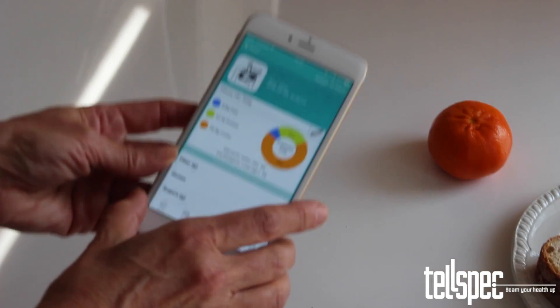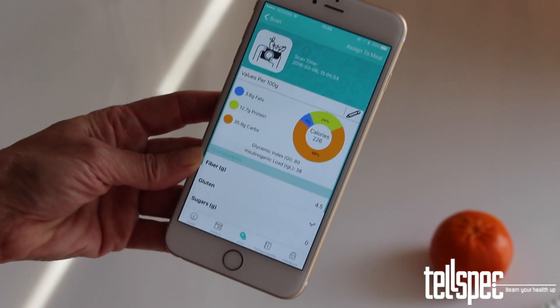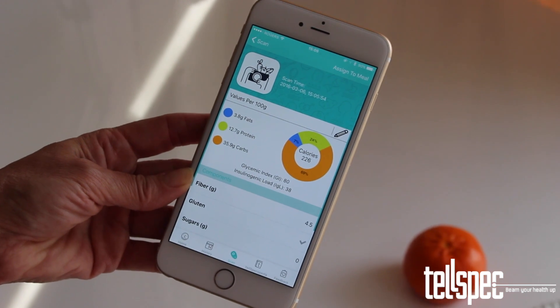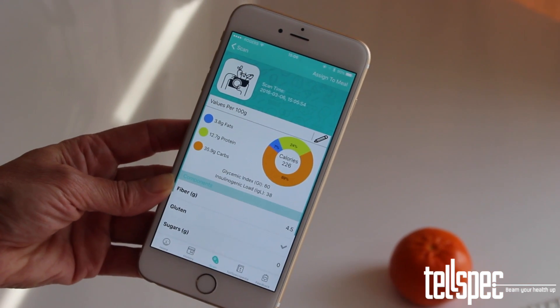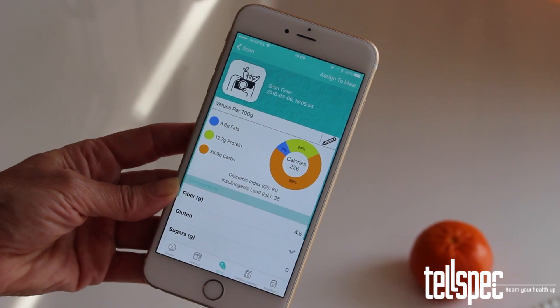You will notice on the app that the data is being transferred wirelessly from your scanner to your phone. When the app has all the data, it is sent to the cloud to be processed and you will then get your results displayed.